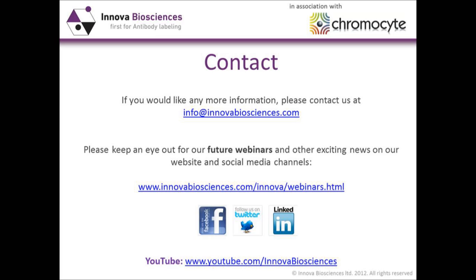Okay, that's an interesting question, actually, Nina. There's nothing within the Lightning-Link kit that would cause you a problem in itself for in vivo use. It's not something that we actually have tested. Basically, the Lightning-Link kit makes your conjugate in exactly the same way. You have an antibody. You're not adding any preservatives.